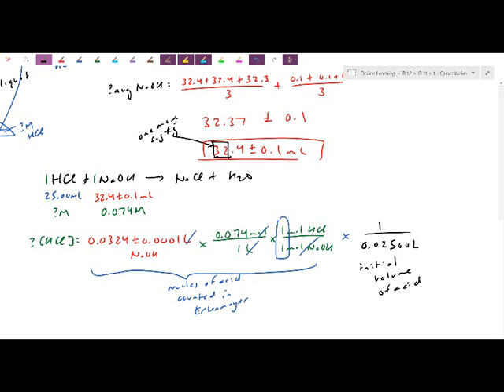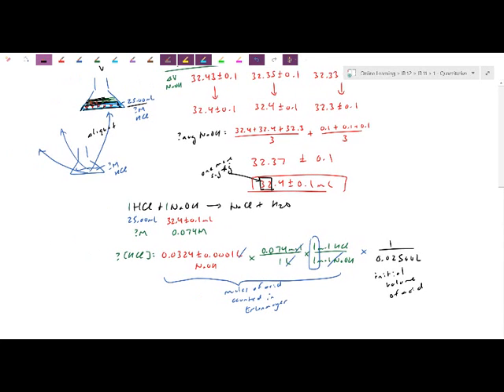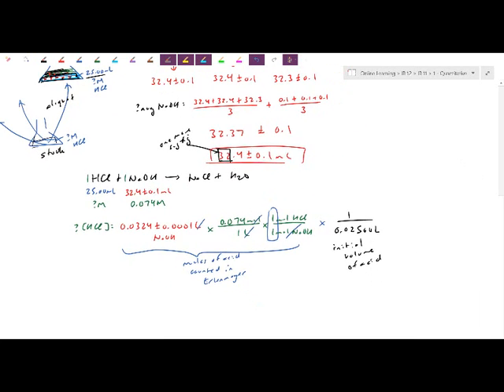You're totally right, I have completely destroyed the sample, but if you remember, this sample came from an aliquot, it came from a stock bottle, it came from a big vat of more acid. If I know the concentration from this calculation, the concentration that I destroyed is going to be the same concentration as my whole bottle, and now I'm ready to use this bottle for other experiments. So let's just type our way through here.